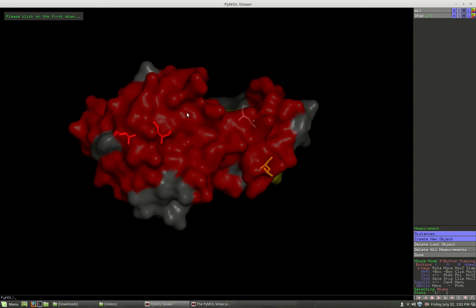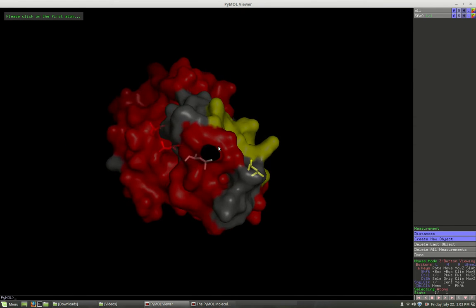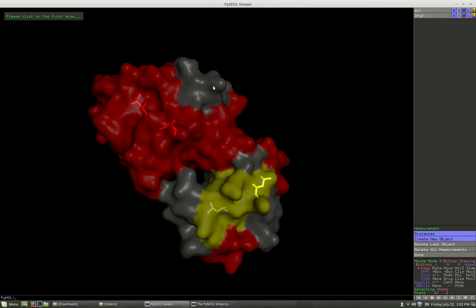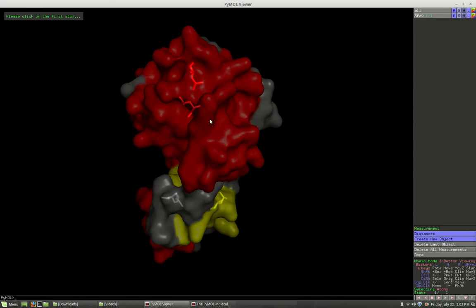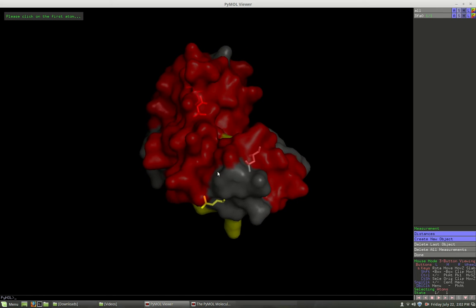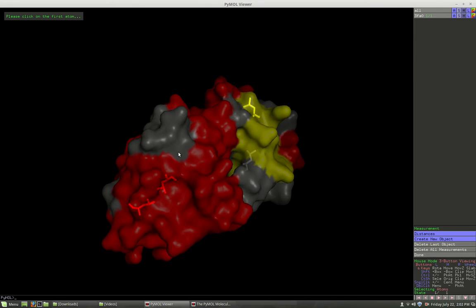relation to it. Are they on the inside or the outside at any given time? When we rotate this around, where are they on our inside here and what they're doing? Could be useful if you're interested in knowing about what's going on inside the molecule as you rotate it and from what direction you want to see how these are orienting themselves, these side chains for these residues. All right, now another thing you might want to do is show spheres.